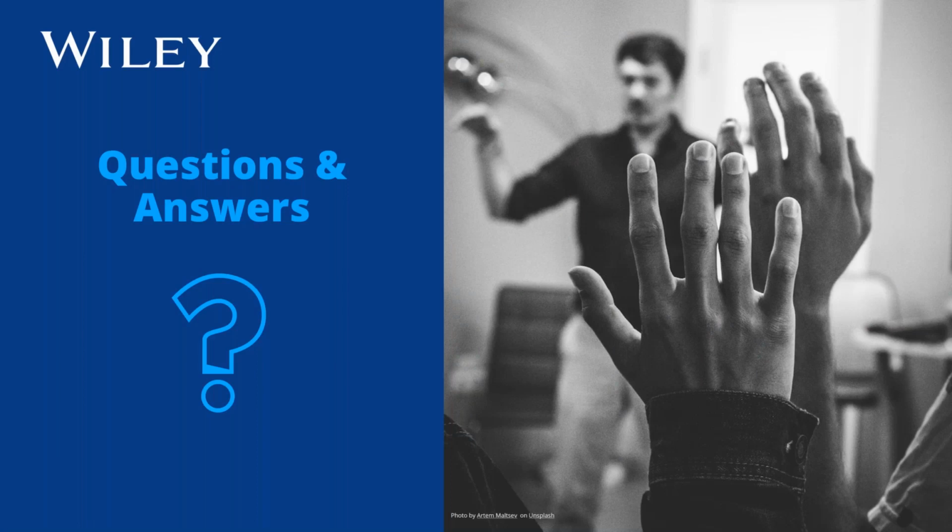So if we have a little more time for a few more, how about, does KnowItAll Quantitation work with both absorbance and transmission FTIR? Yes, it does. KnowItAll works with that. We have a long history of working with them. Thank you, Michelle.